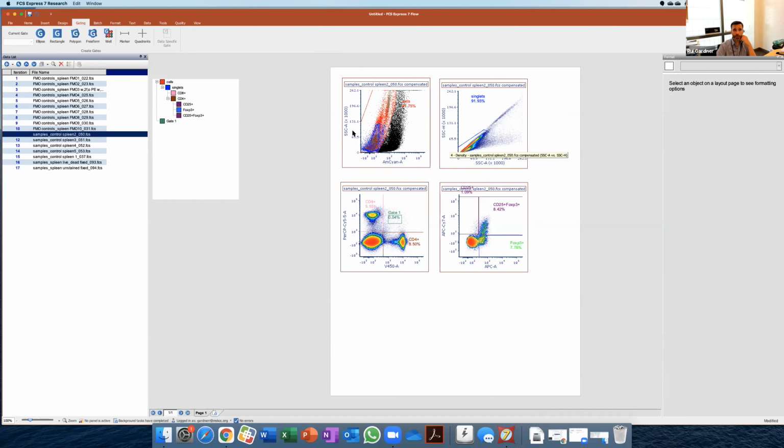Yeah, I usually say that you need to be objective when you set the gates, and then you have to use this objectivity in a consistent way across all your samples for that day. I think one of the important things is also to avoid variation between instruments, between days, because even the sample preparation done on different days may vary slightly. You may not wash the cells as well as you would wish. There's some variability in the centrifuges and pipetting, all these things. So there could always be some variances.